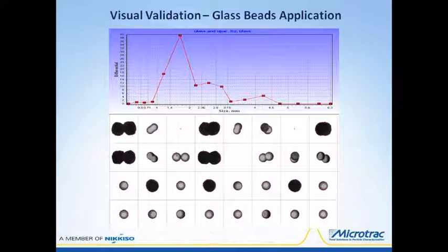This is a sample of reflective glass beads used in highway coatings, with some sand added for traction. In this small excerpt from the SI's image file, we can see good round transparent glass beads, bad fused glass beads, single black opaque particles and agglomerated opaque particles, both of which are sand grains.